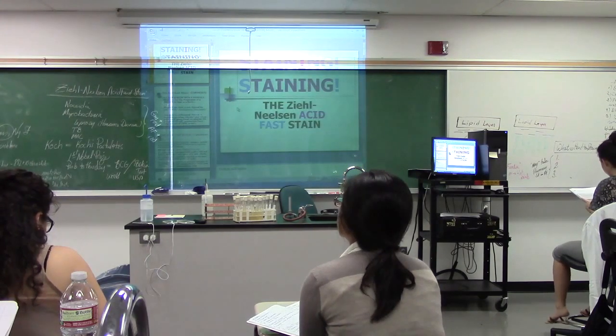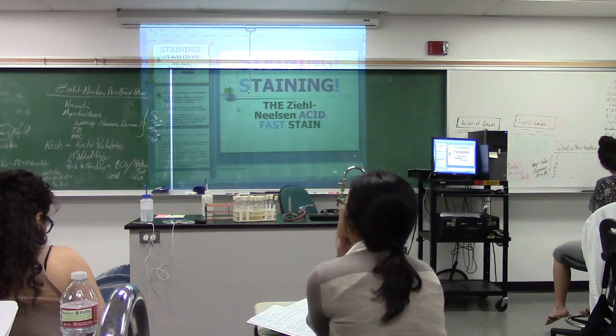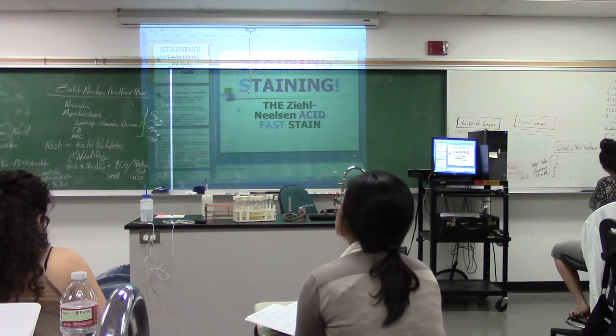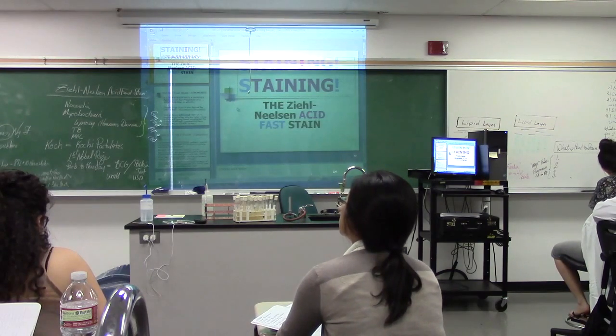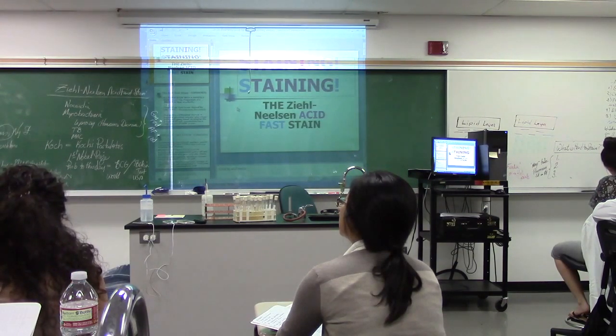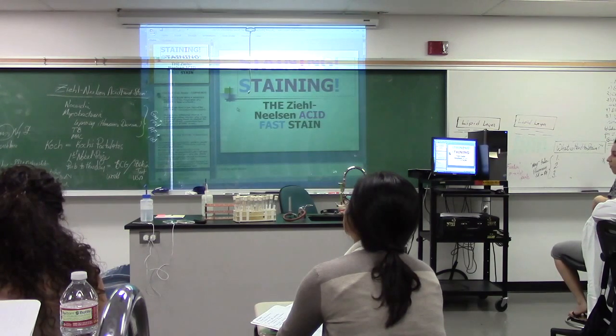Next class, that means Wednesday, we're going to be doing the easiest stain to do, the hardest one to read. And the easiest one to do is the endospore stain. I mean, it's just 2 colors with water in between. Incredibly easy to do, but incredibly difficult to interpret because you've got to actually think. I know, you don't just jump at a color.